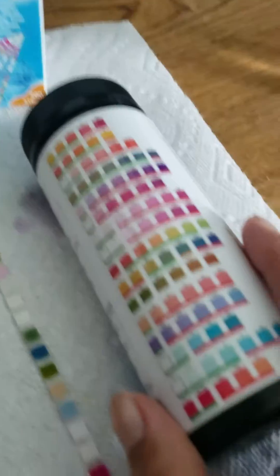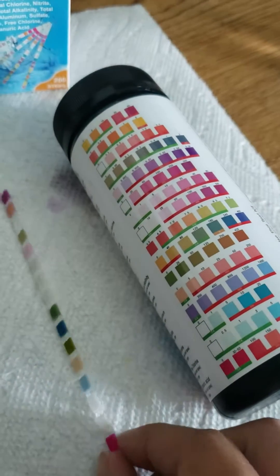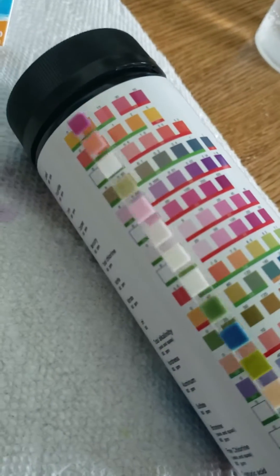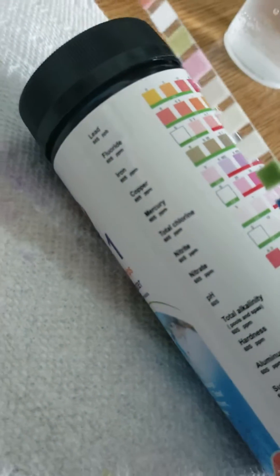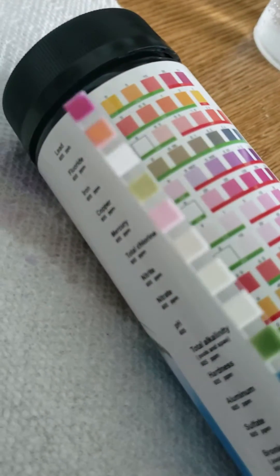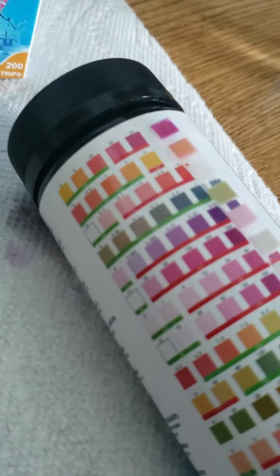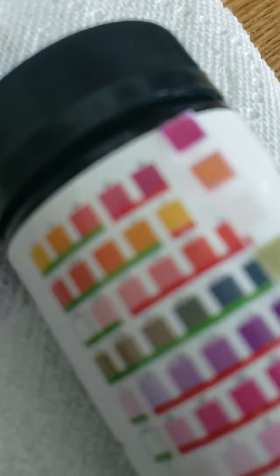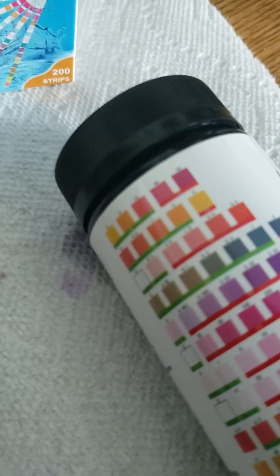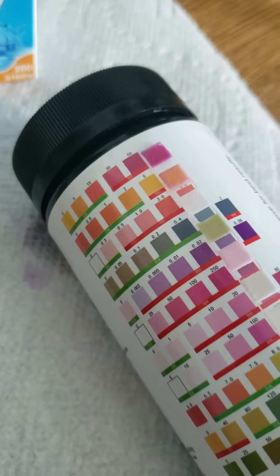We're going to start reading our results, going down the strip starting with the first one. The first one is lead — we go across and see, and this one we got a positive result. It's all the way over here on the 50, so that's a positive result for lead.